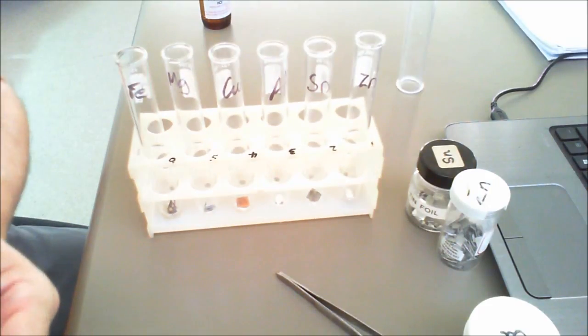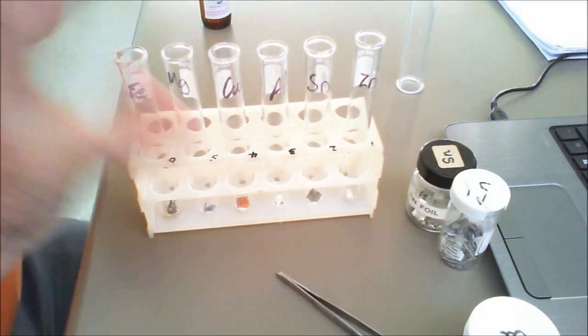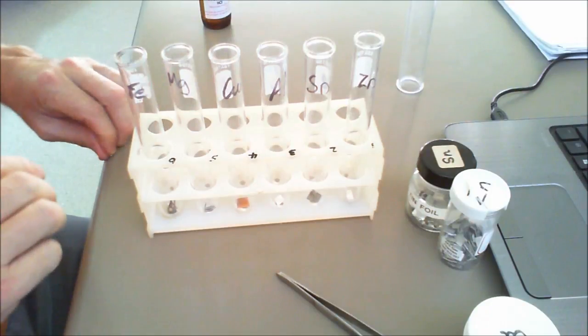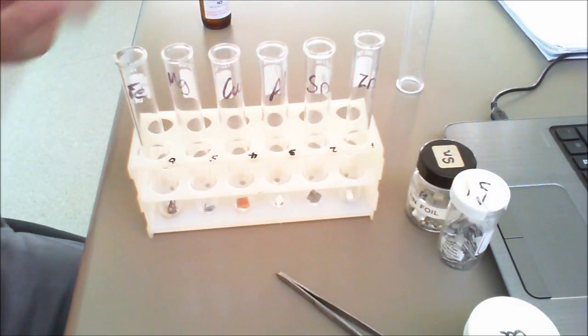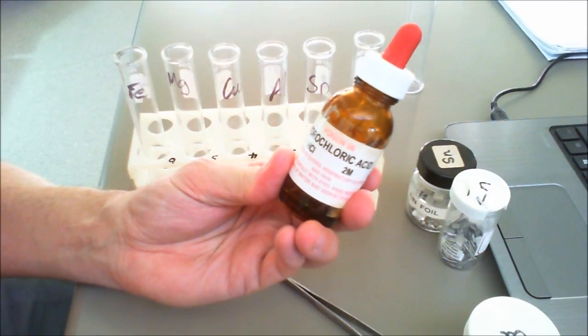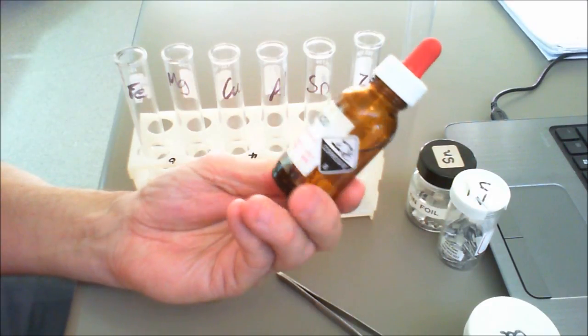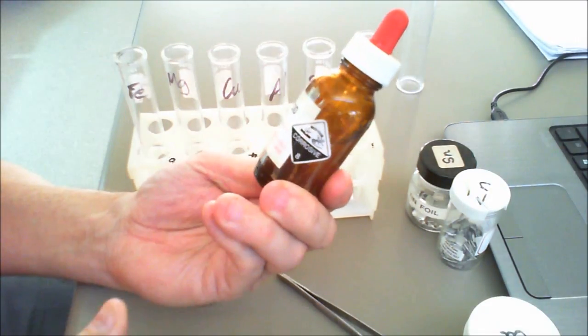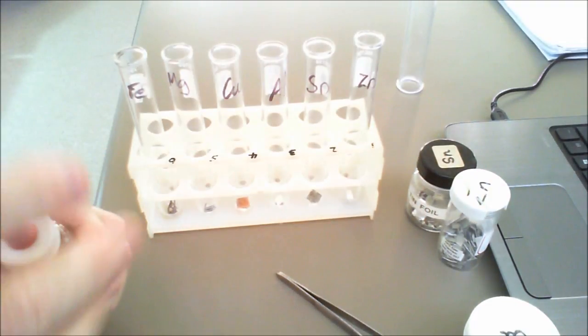Now again, obviously with this particular practical, the idea is to make sure that everything's labeled, everything's easy to see and easy to read. Now what I'm going to do is use our good friend, two molar hydrochloric acid. This one's got the corrosive sign on it, and that tells us that it is in fact corrosive.